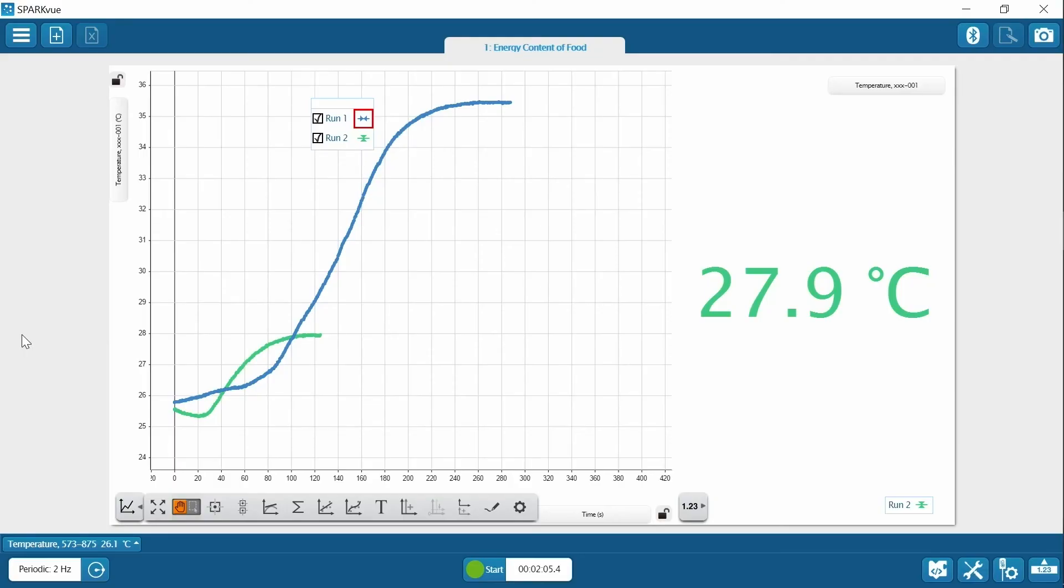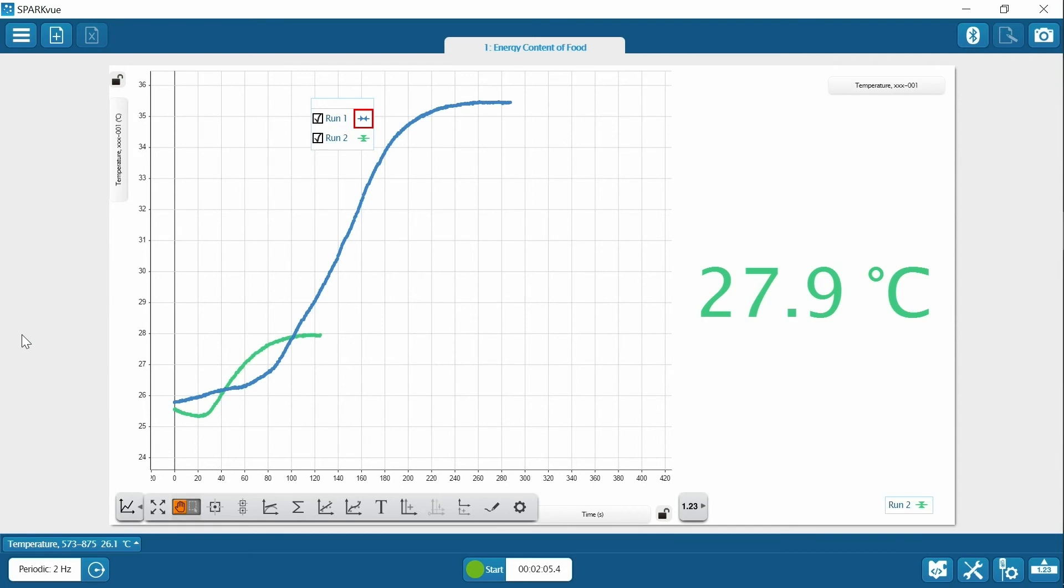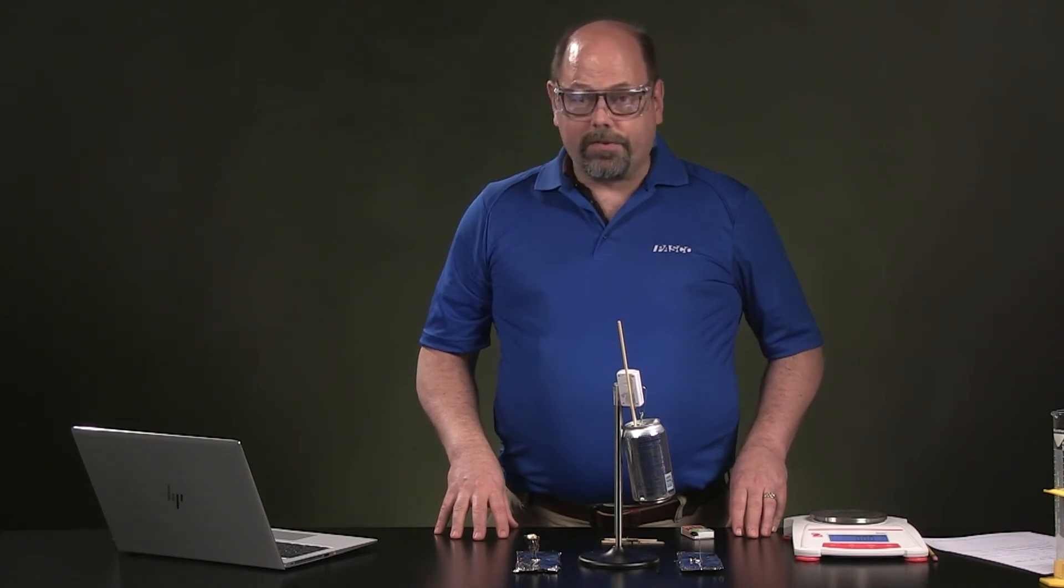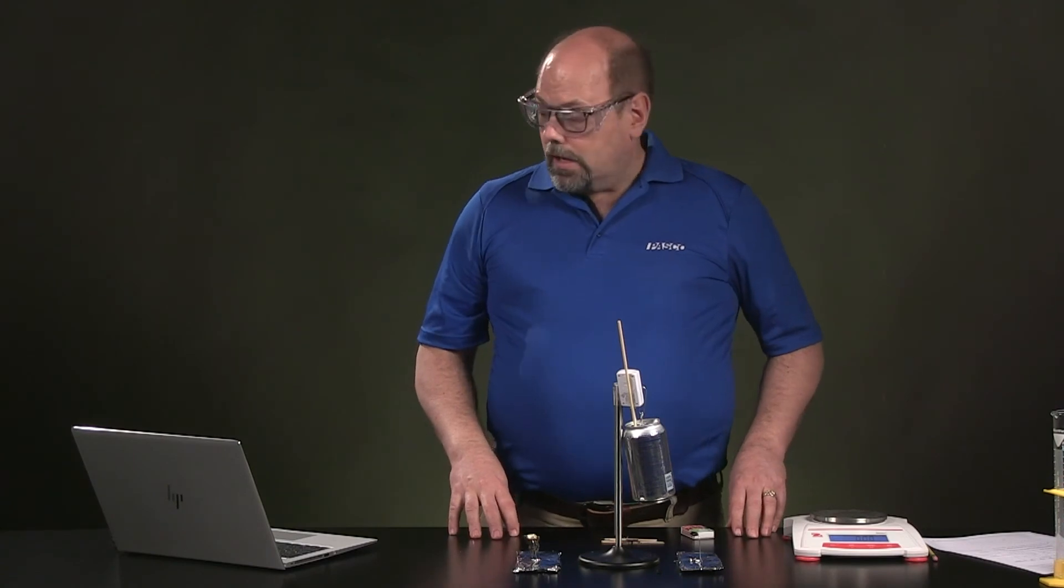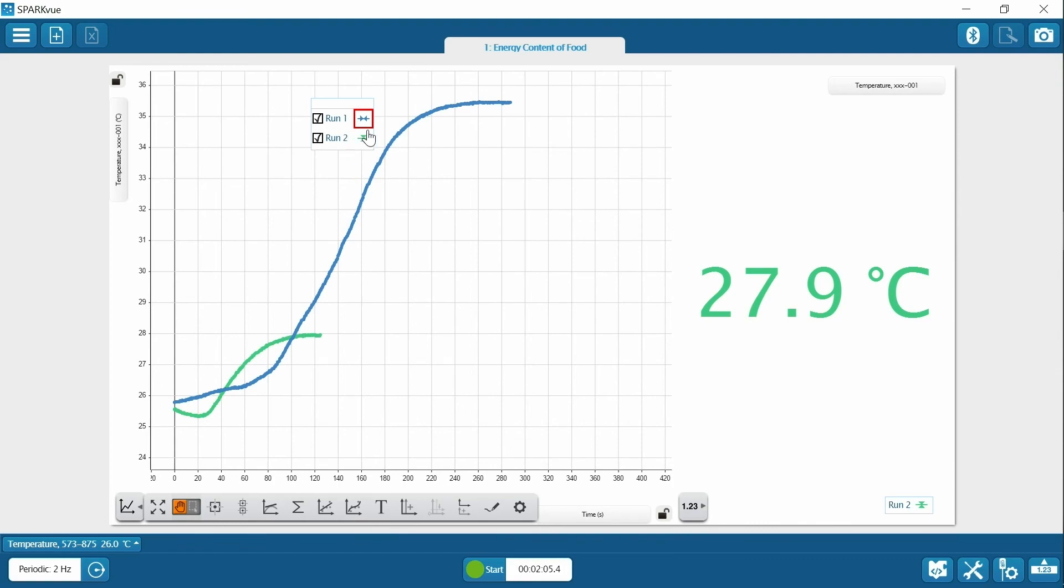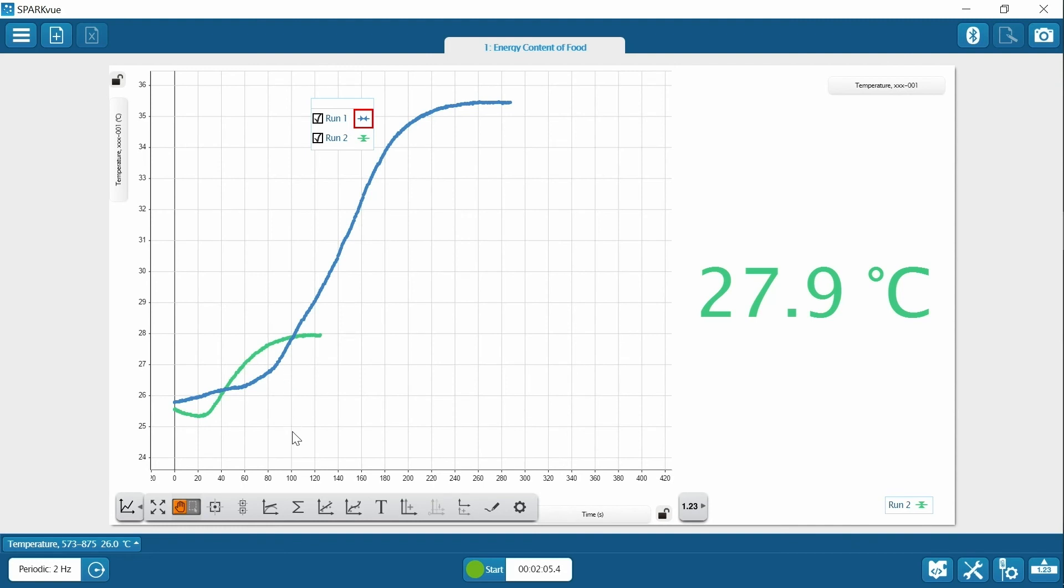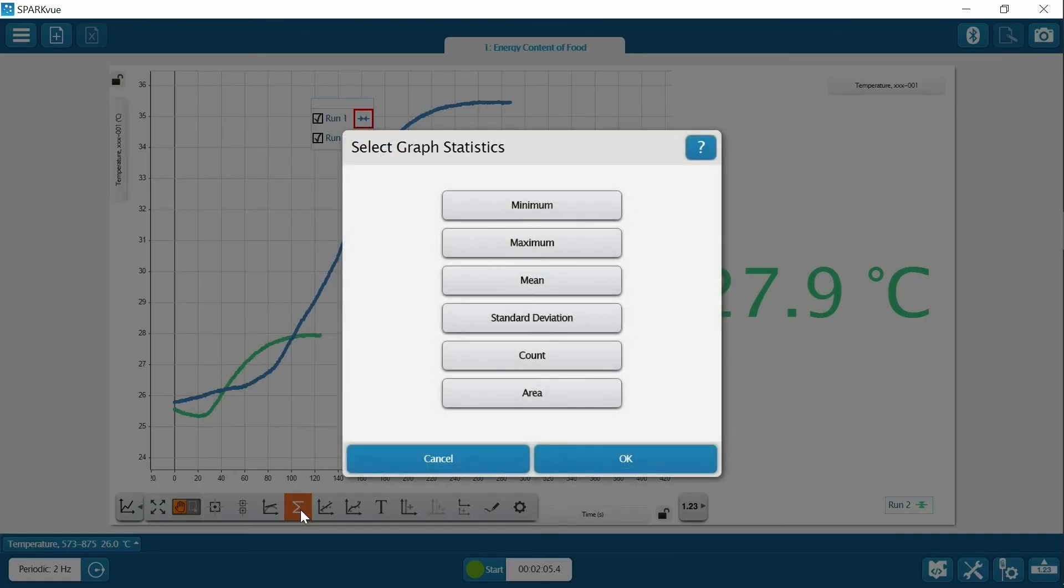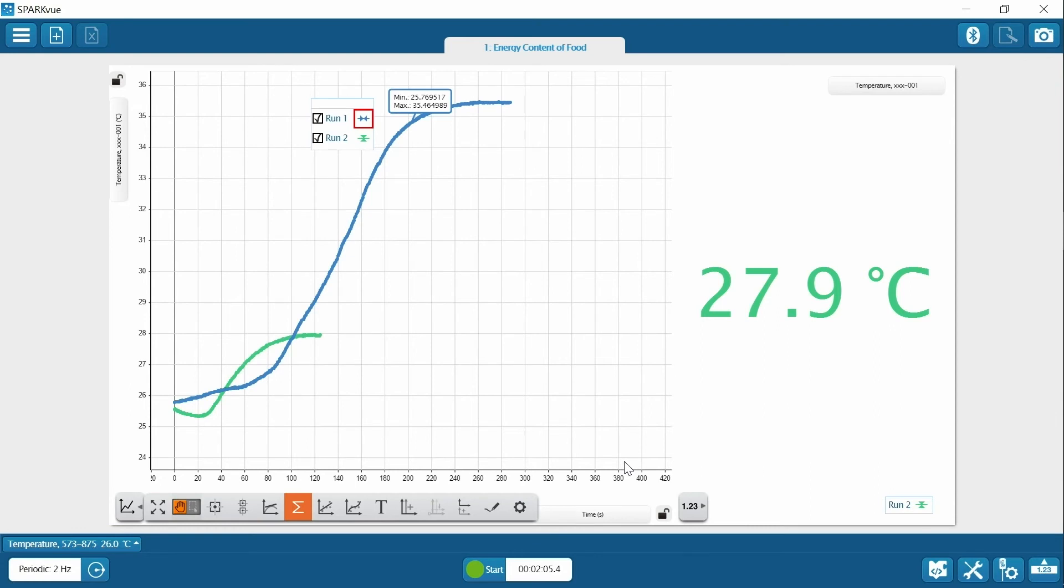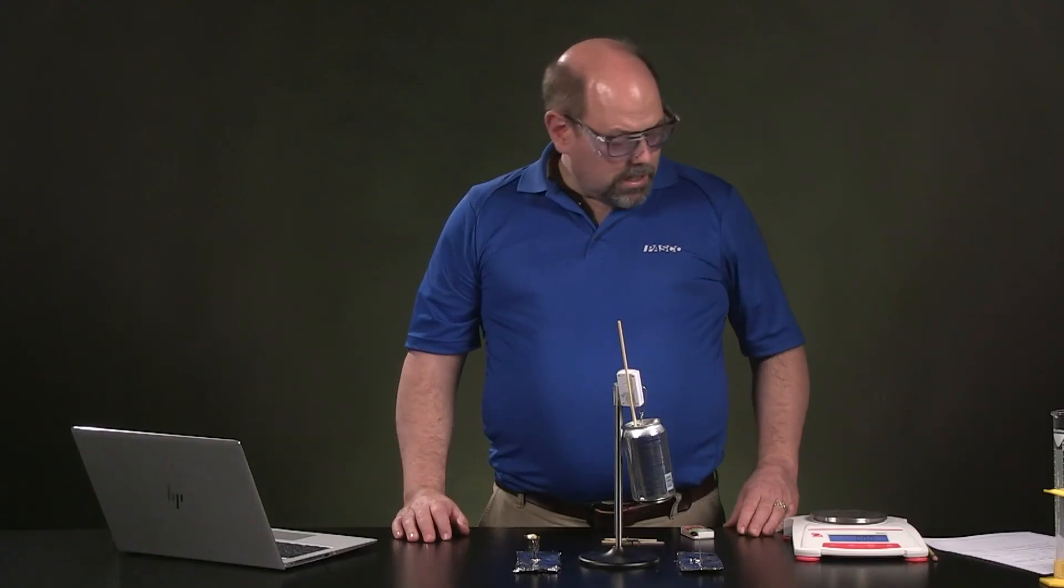Now that you've gathered the data, I've gone and turned both runs on and you can see both of the temperature changes that occurred, one for the marshmallow and one for the peanut. It's not fair just to compare them right off like this because you burned more of the peanut than you did of the sugar content or the carbohydrate. So we're going to figure out how much per gram heat has been delivered. You're going to need the highest temperature and the lowest temperature to be able to determine that. And what you're going to use is the statistics tool at the bottom. You'll notice I've got run one. There's a little red box around the data marker. That means I'll be doing statistics on that run. So if I click on this, you can choose it to show what is the minimum and maximum values. And that'll help you to determine if you don't want to just read them right off the graph, the highest temperature and the lowest temperature. And you can see there that it's about 9.56 degrees, 9.7 degrees change. So you're going to want to record that.